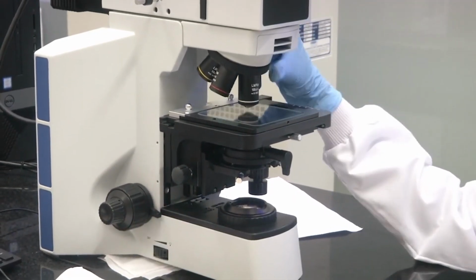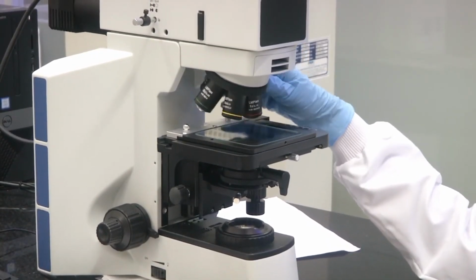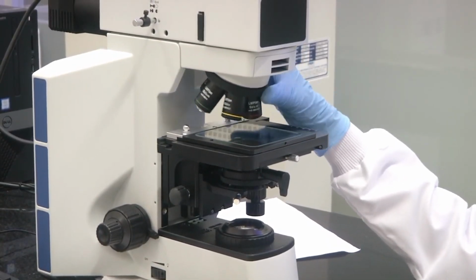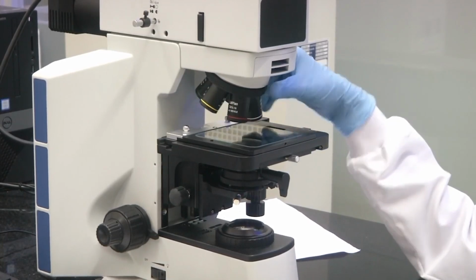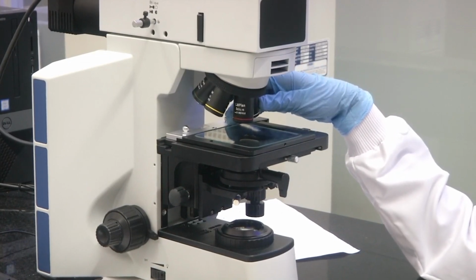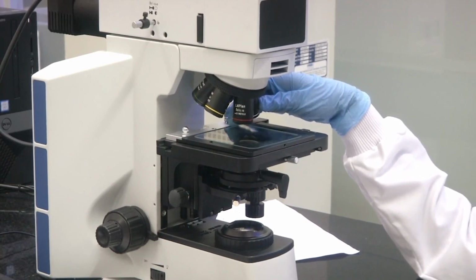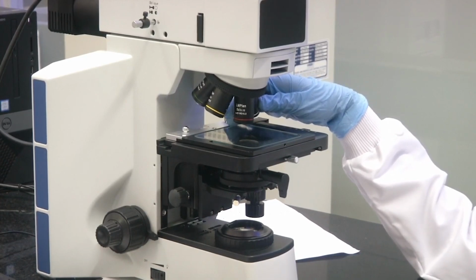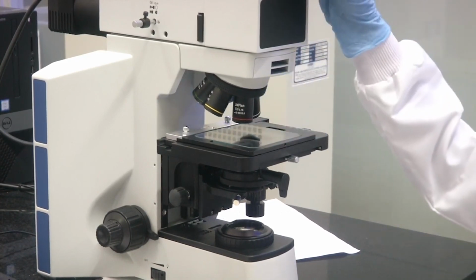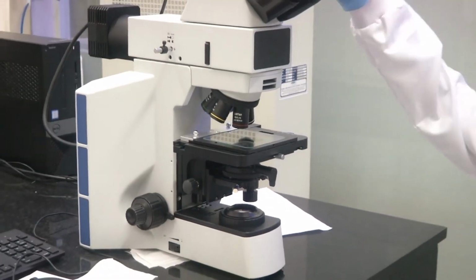This part of the microscope, which I am rotating now, is called the turret. This turret can house multiple objectives. The objective is basically your core magnification part in a microscope. It consists of a lens of a particular magnification which is connected to your eyepiece. As we had discussed before, the eyepiece, which you can see now here.